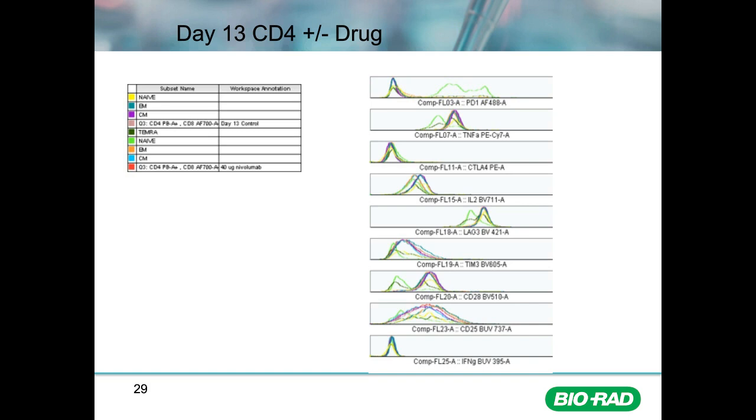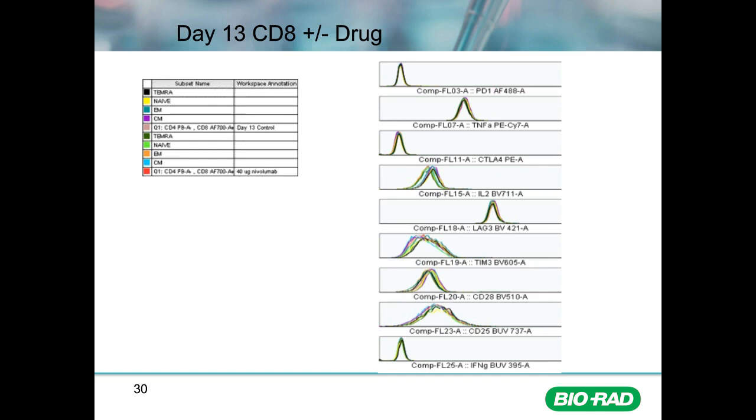Finally, T-SNE analysis was performed on the CD8 T cells following 13 days of stimulation in the presence and absence of the PD-1 inhibitor nivolumab. No difference in checkpoint inhibitor expression, cytokine production, or activation marker expression were observed when comparing treatment versus non-treatment groups.